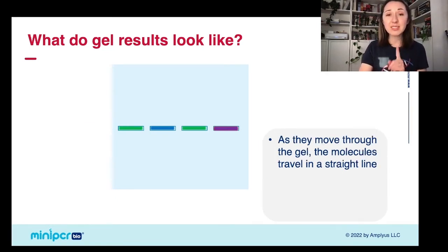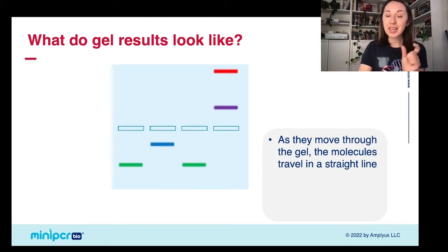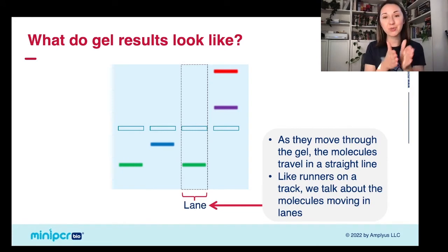Now, one of the things that I want to point out is that the dye molecules are going to move in a straight line towards those electrodes. And so we call these lanes. So it's kind of like runners on a track, where a runner will stay in their own lane. So when we're talking about these things, the vocabulary that we're going to be using is we're going to be talking about all of these different lanes that held our samples.